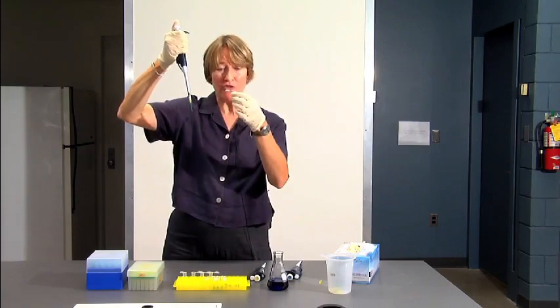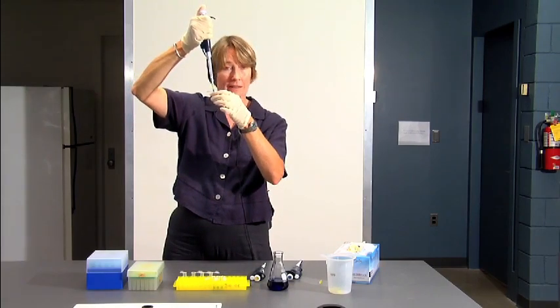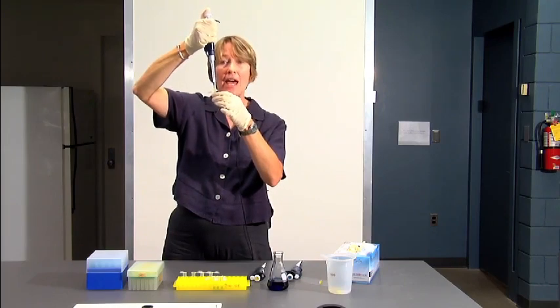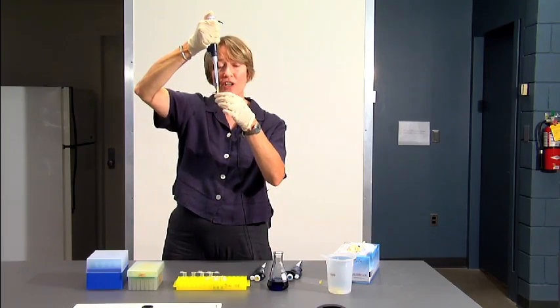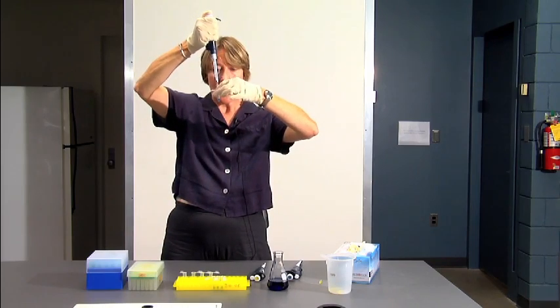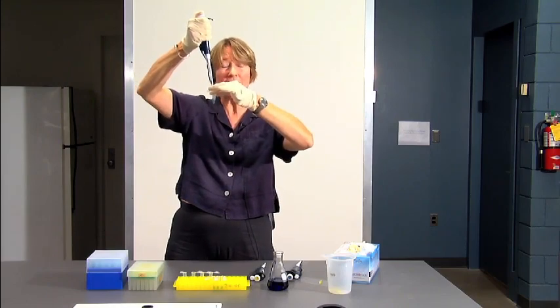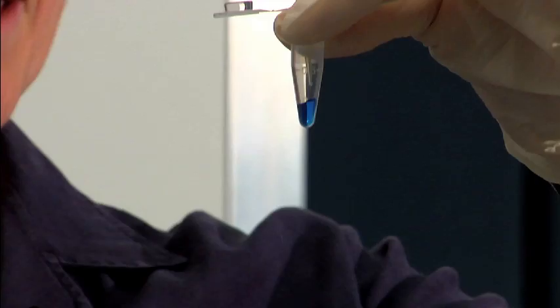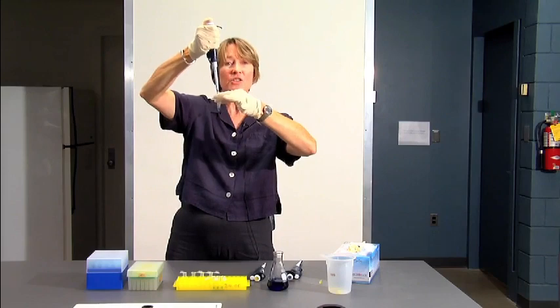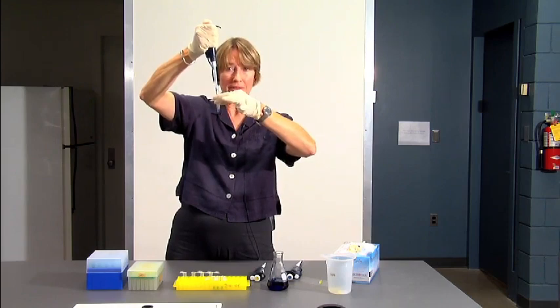I'll then take a microfuge tube, and I will put the tip into the tube, and I will now depress the plunger again and release the sample into the tube. And you may be able to see that there's just a tiny, tiny drop, hardly even noticeable, still left in the tip of the pipette. This is where you depress it to the second stop to push out that last drop.